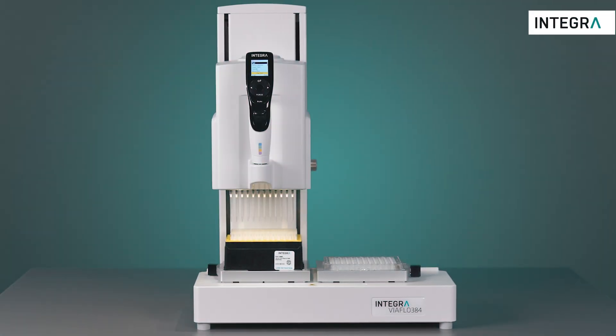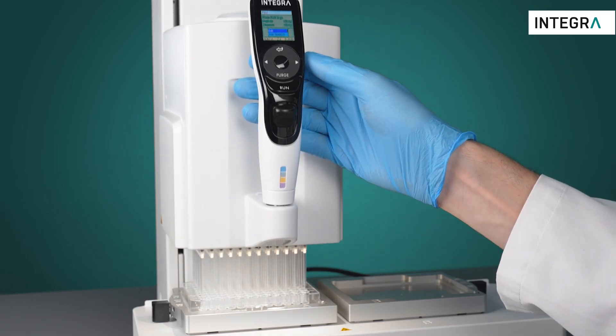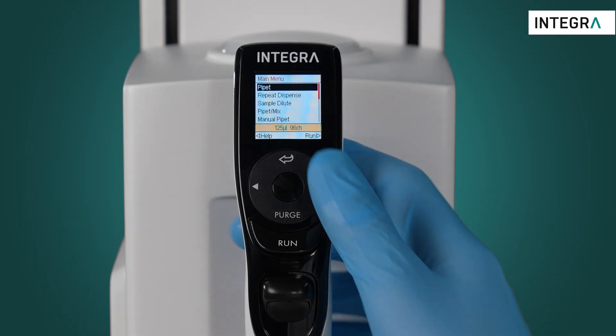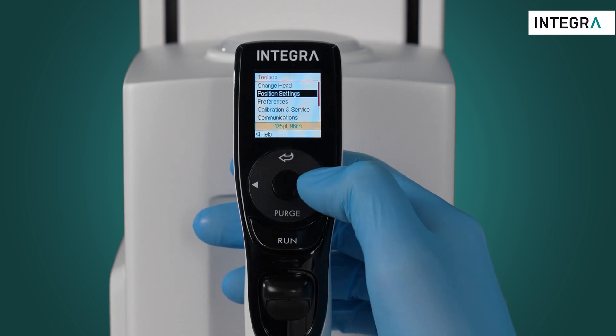Position settings can be activated when needed. These help to precisely align tips within the wells or to stop tips at a desired height. Go into the position settings menu from the toolbox. From here you can activate or deactivate the feature which guides you directly into the wells.